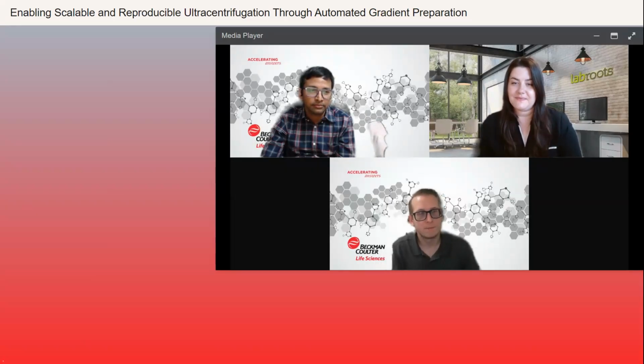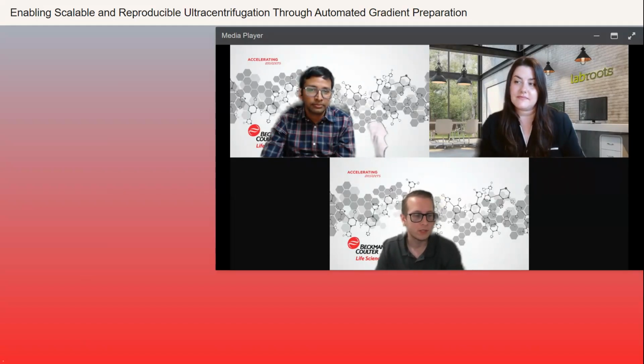All right. So calibration is really important mostly because of the reason that Bala mentioned before. We do have liquid level sensing on the instrument. That's what the dispense probe is doing in addition to dispensing. And so we wanted to design this so that if you are running a method, you can simply walk away. When you come back, your tube would be sealed and ready to go into the rotor.